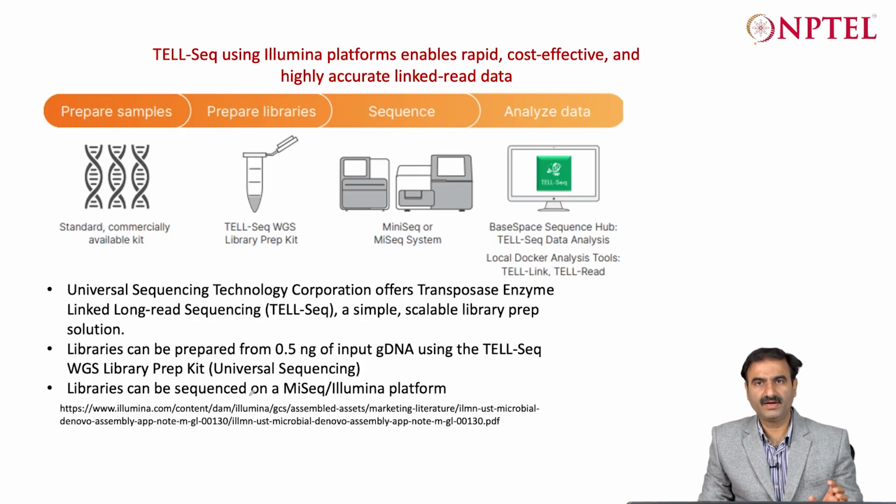Okay, so we were discussing the linked reads by Chromium. There is one more technology that is Illumina supported, that is Tell-Seq, and it can also do linked reads by a method completely different from 10x Genomics, and that is also coming up and has been used recently.